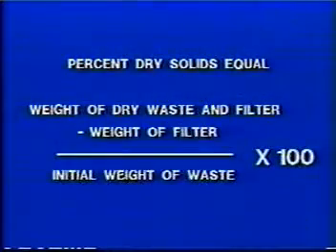Take care to ensure that flashing will not occur upon heating the solid. The use of a hood is recommended. Calculate the percent dry solids with this formula. Percent dry solids equals weight of dry waste and filter minus weight of filter, divided by initial weight of waste, multiplied by 100.